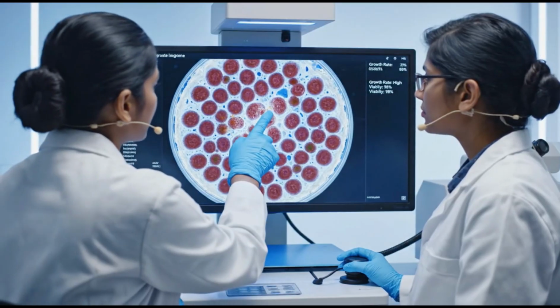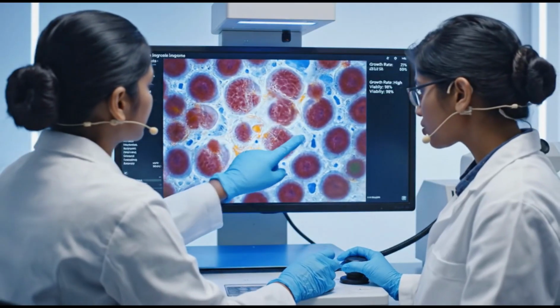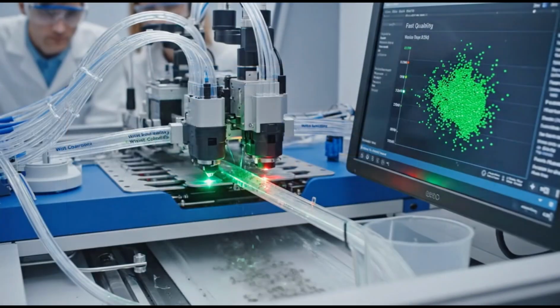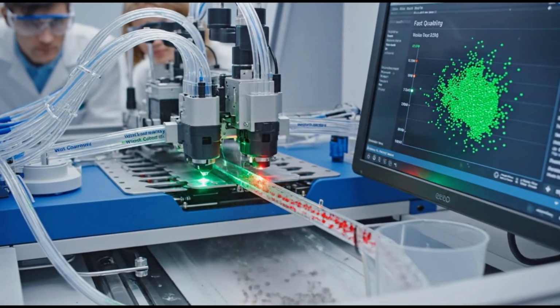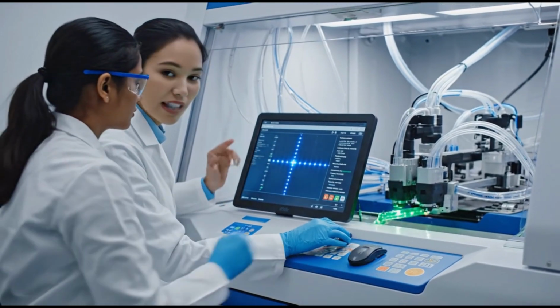The density in this area has increased significantly. I agree. The viability markers are strong. Let's maintain the current parameters. We've stabilized the laser sensors. The sorting should proceed smoothly now. The viability data looks excellent.